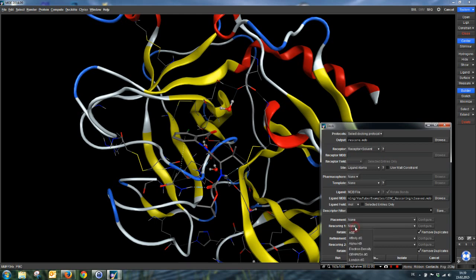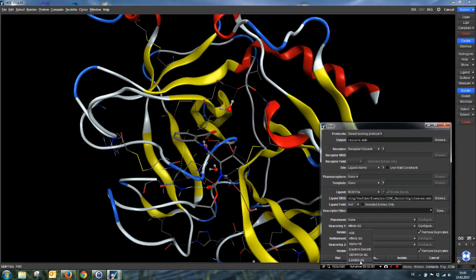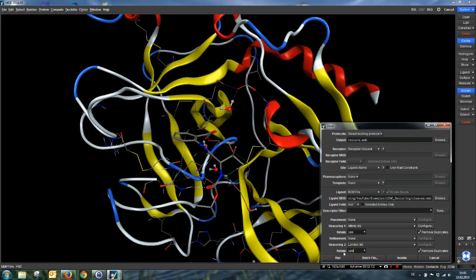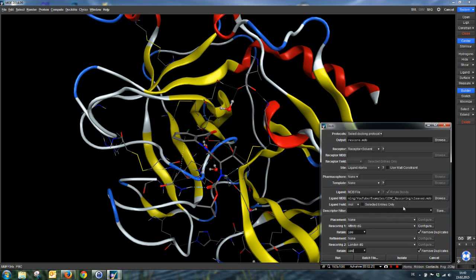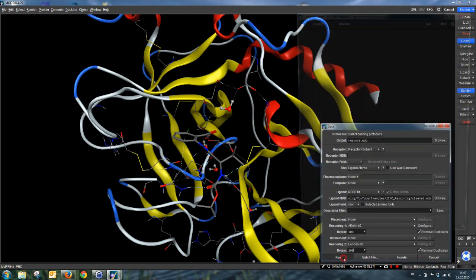We use two scoring functions in this example: the affinity DG score and the London DG score. As we had a maximum of 100 retaining poses in the docking example, we can also use 100 here, so we won't lose any pose during re-scoring. Now we just have to click on run.